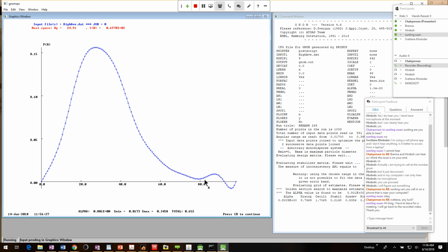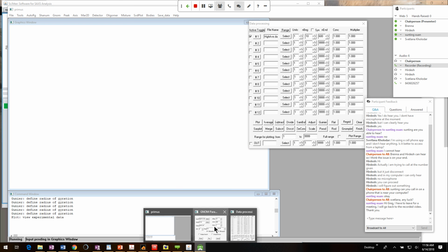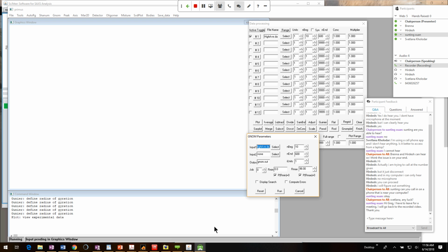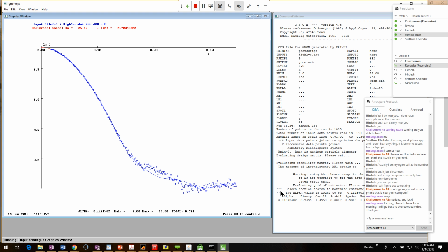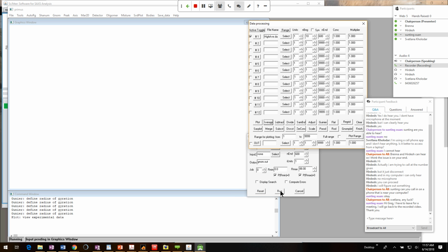And there's some messed up part here. So I want something smooth coming down. It might be here in the 80s. It might be beyond that. And when you publish your Dmax, you should publish what the error bar is. So 98 isn't quite right. Let me try something in the 80s. Still doesn't fit the data according to GNOM, and this bump is not good. So let's go to 108.